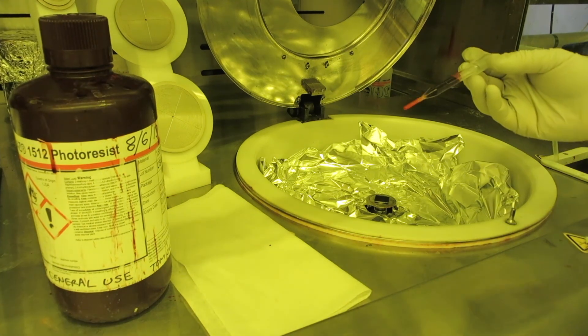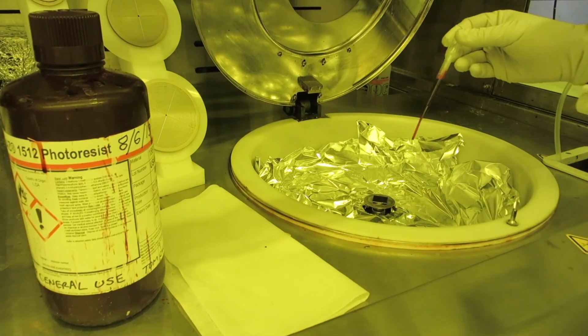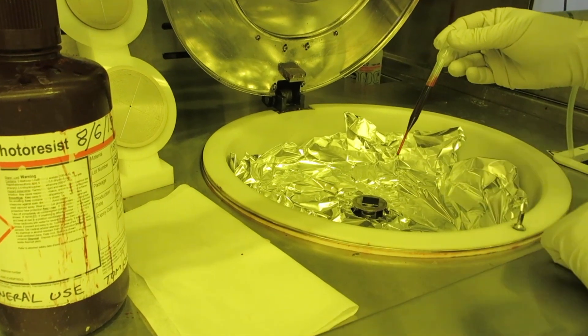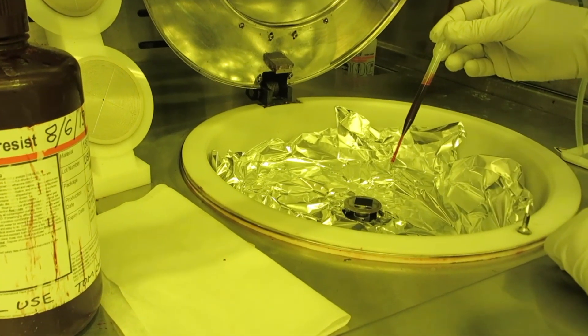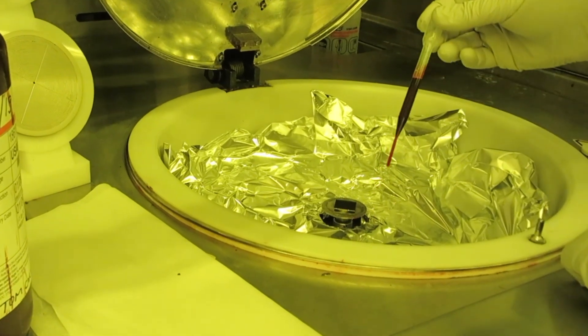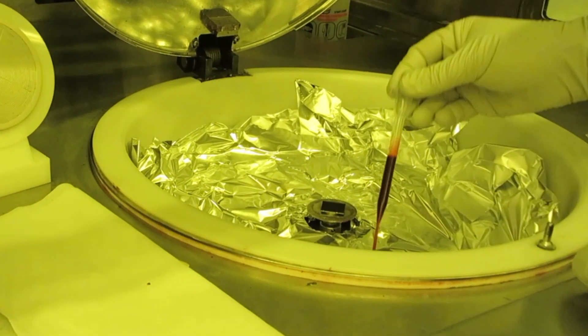If you do have a bubble, you can squeeze it out onto the foil. When you see there are no bubbles left in the pipette, start dispensing it onto the chip.